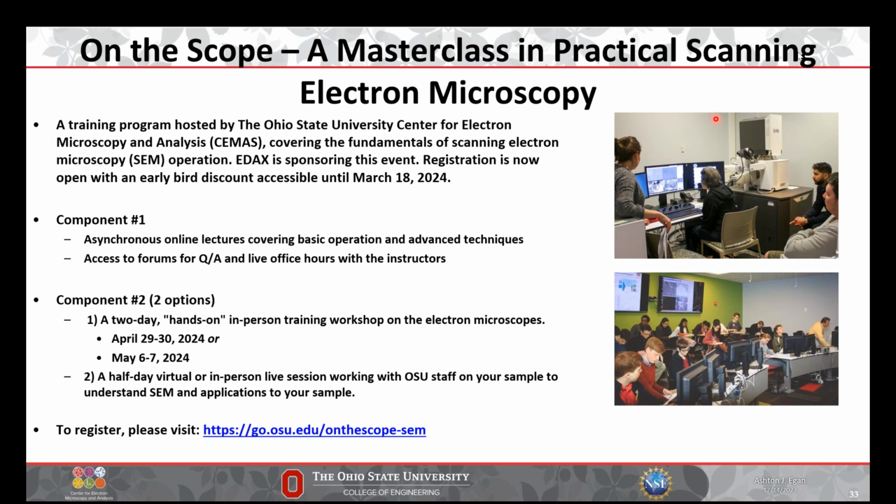Thanks, Dan. We've had a few questions come in. How did you prepare the nickel superalloy sample in the ECCI analysis?